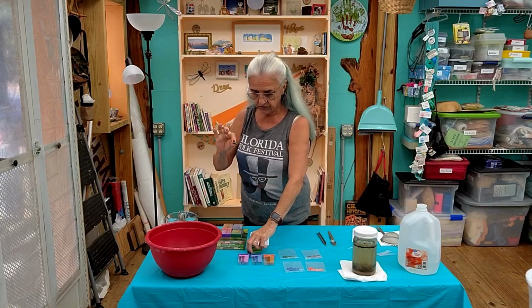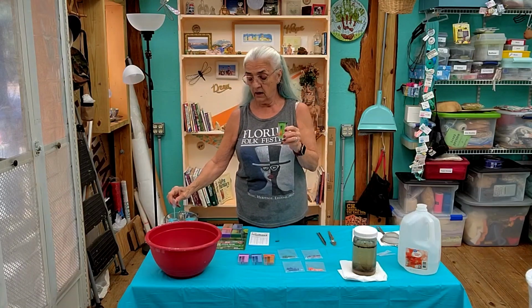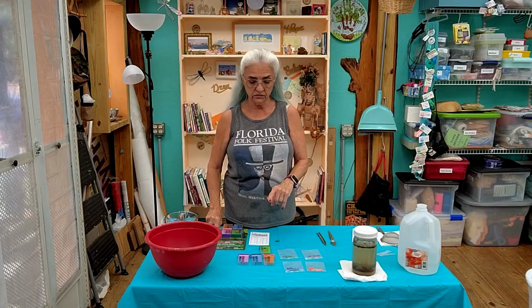And so these capsules, once you put a sample of your soil, it actually has a little line. You will put your soil up to that little line. Then you will open this capsule and pour it in there, and the white powder, whatever the chemical is, will be on top of that. And then they give you a pipette so that you can take a sample of the water, which is distilled water, and you will put that water in there until it gets up to the level that it calls for. So we're going to do the sampling for the pH first.